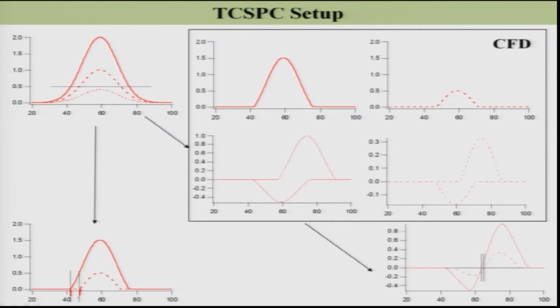It cannot be 0, but it can be reduced significantly. I have done a simple thing to show you the function of the CFD.